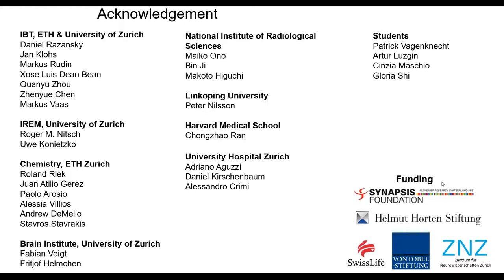Yes, thank you for the question. So there are actually a lot of agents existing, also for detecting neuroinflammation, as well as for glioma. Many of these compounds have a multimodal concept. So we previously also used MMP compounds to detect the metalloproteinase in a stroke mouse model.